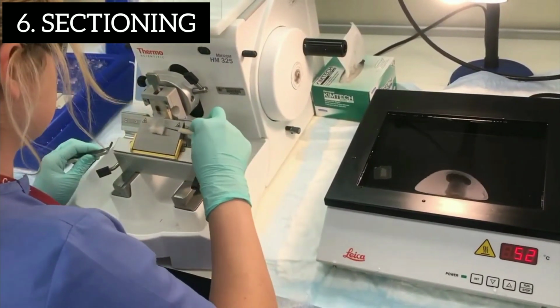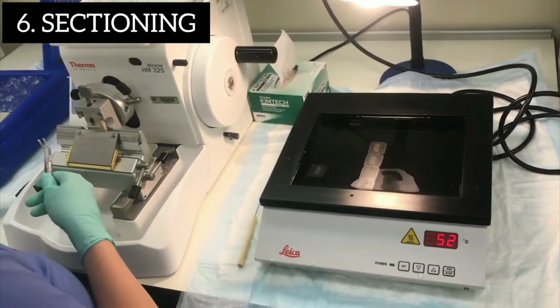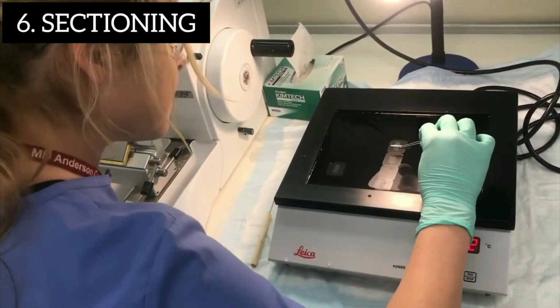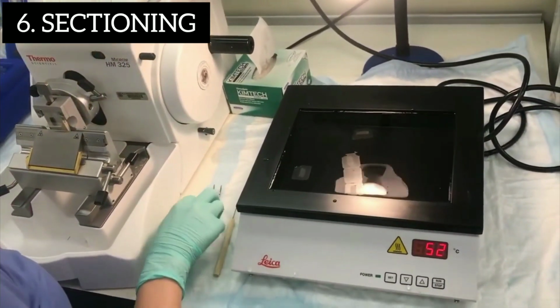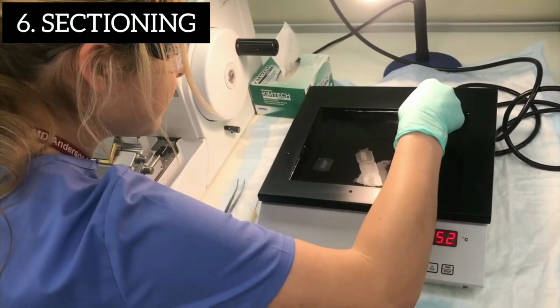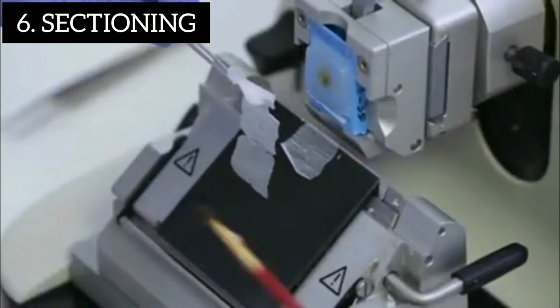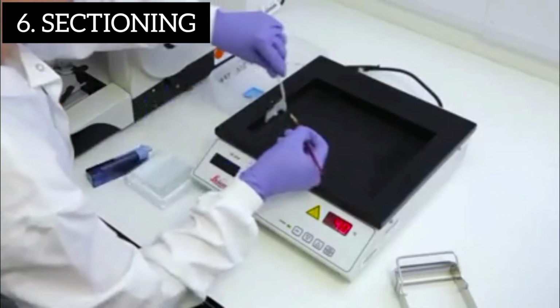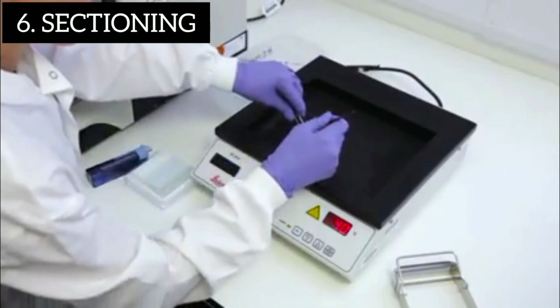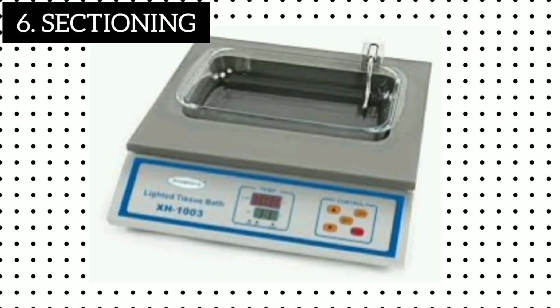The sections are placed on a flotation water bath set at a temperature of 5 to 10 degrees Celsius lower than the melting point of the paraffin wax to eliminate wrinkles, remove entrapped air, and flatten and smoothen the surface of the sections. If the sections are too wrinkled, the addition of 70% alcohol solution to the water bath can remedy this prior to placing it onto the slide with adhesives applied on its surface.